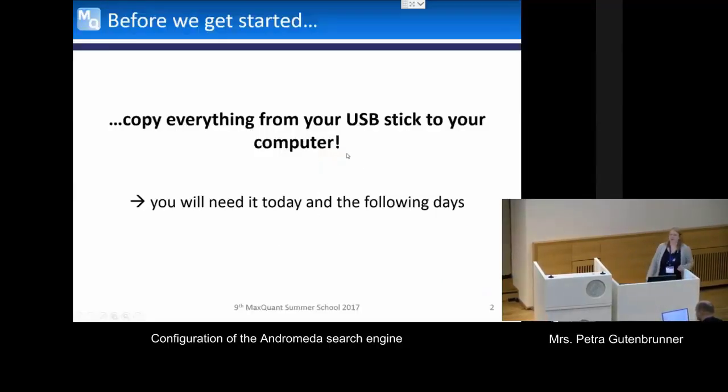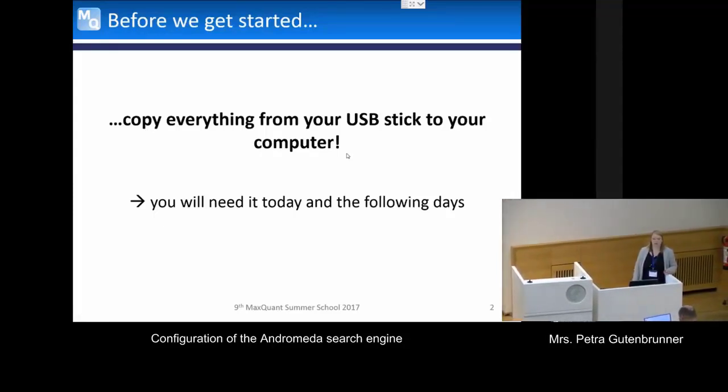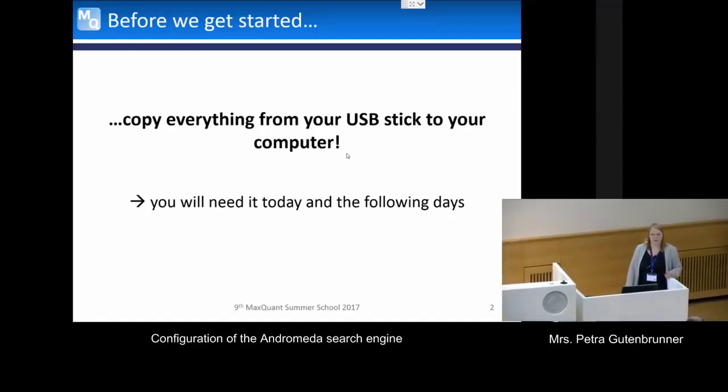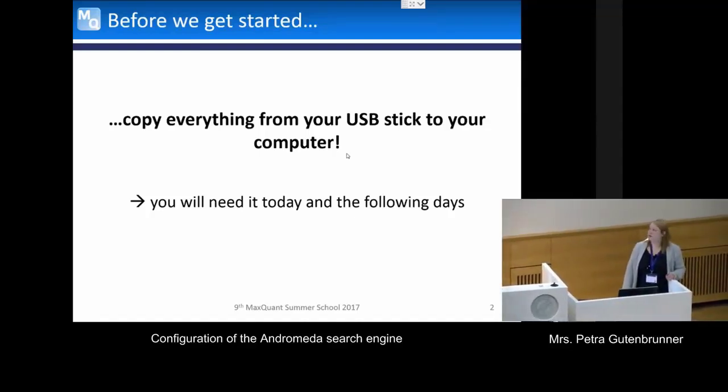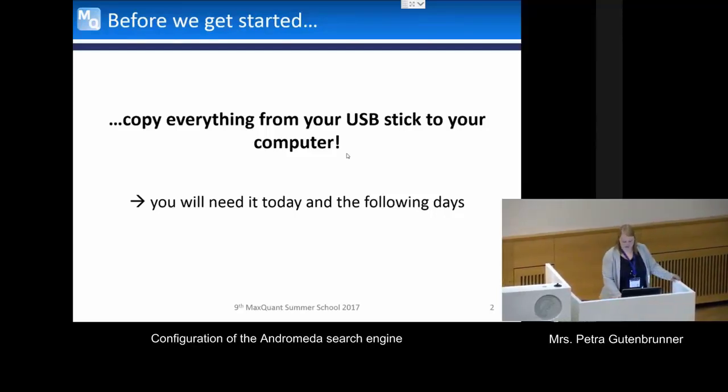So before we get started here, you've all got a USB stick, and maybe you have done that already, but I would suggest please copy now all the data from the USB stick to your laptop, because you will need the data in this tutorial and also in the following tutorials today and the following days.